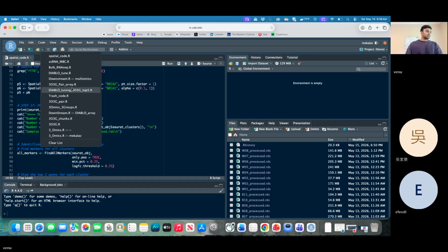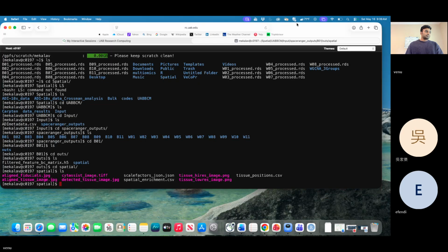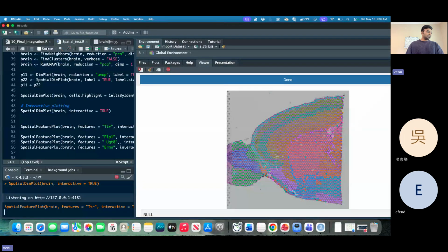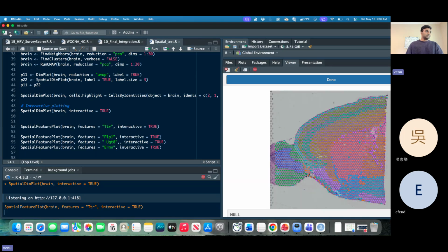In your previous lab, how long did it take? For single-cell data, it takes 8 to 12 hours for me, depending on memory and everything. Is it running on a GPU machine? Yes, we have a separate HPC cluster. We always log into that HPC computer and run all these steps.